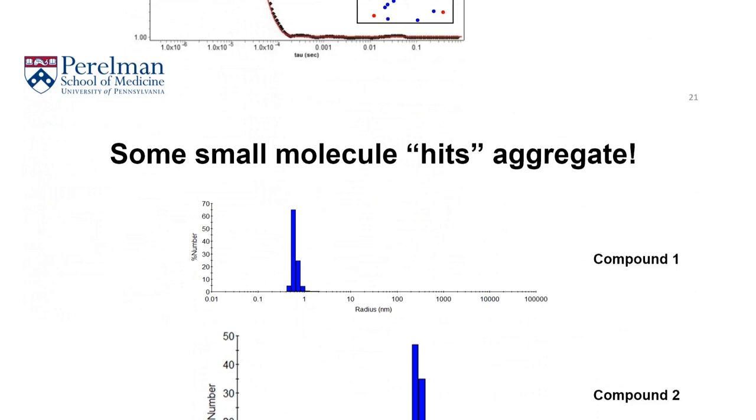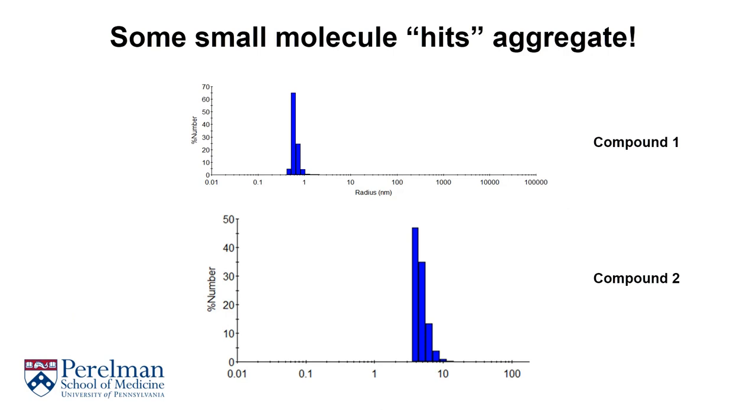When screening compound libraries against a target, in this case integrase, it's not uncommon to realize that many of the hits are going to be false positives, because the signal has been affected in an inappropriate way. Many a time, this is because of colloidal aggregation. Simply stated, some molecules will bunch up and self-associate in certain experimental conditions, tickling your screen's output. This can be easily flushed out using dynamic light scattering.